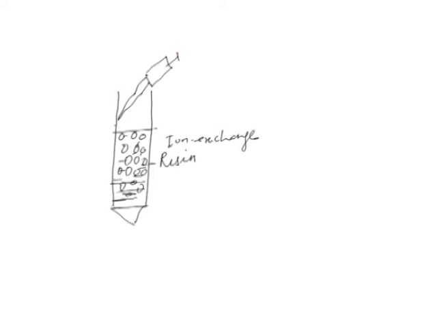In ion exchange you can have any volume of sample, as this is a displacement kind of chromatography, where the ionic species will bind to the oppositely charged ion on the resin. You can even put the resin itself in the sample and let it bind in a beaker, and then load it onto the column. That can also be done.